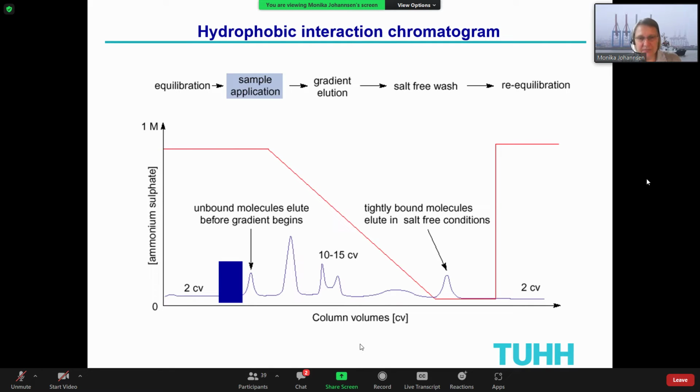And also here, as we just discussed for the ion exchange chromatography, if we deal with protein solutions, fermentation broth, and so on, we also have to take care about fouling issues, so in the re-equilibration we could also add some additional washing steps with other solvents, which might help to remove the material which is left on the column.